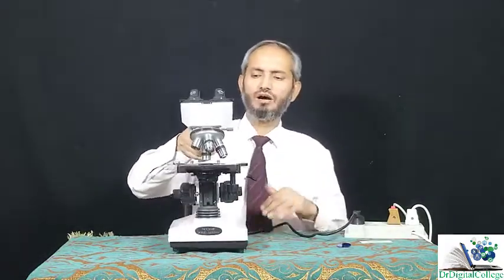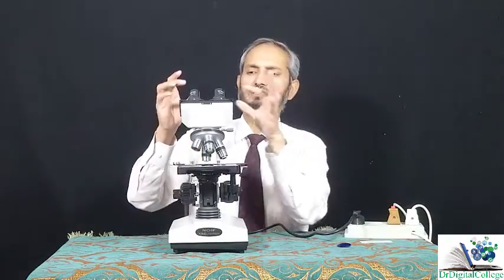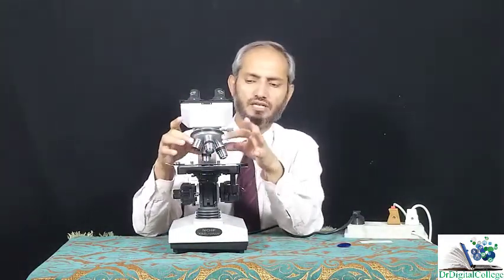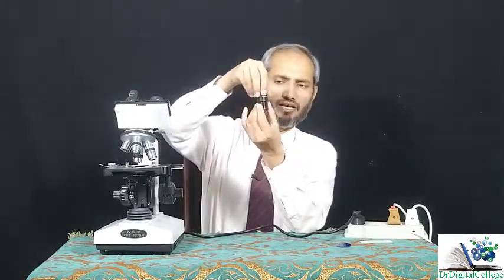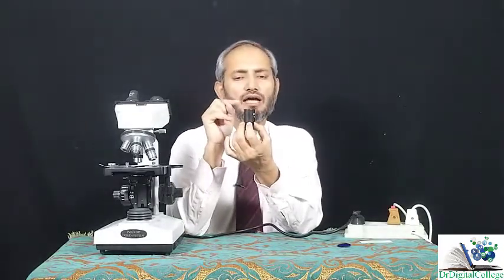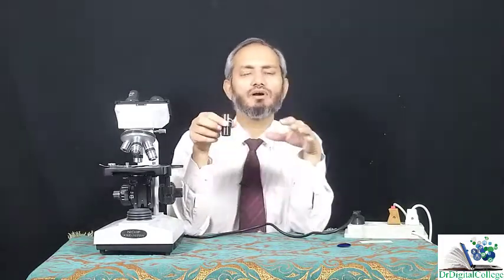And the cleaning of this light microscope is once again the job of your lab technician. These eyepiece lenses and the objective lenses can be removed and cleaned. One thing you need to know is that you should be able to take it out, open it, and put in your eyepiece graticule, the small micrometer for the measurement of the cell. You will come across how we use this light microscope for the measurement of the actual size of cells and tissues by the use of a stage micrometer and eyepiece graticule. In the next lesson, I will tell you how we do the measurements of the cells.